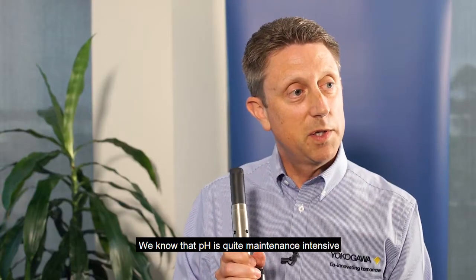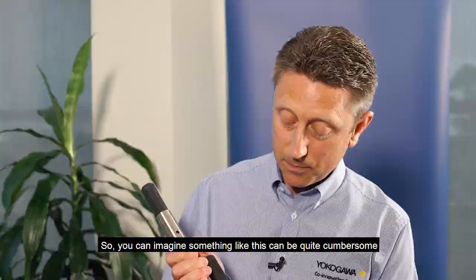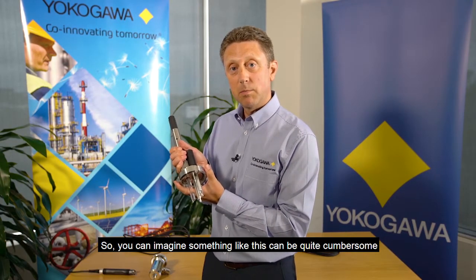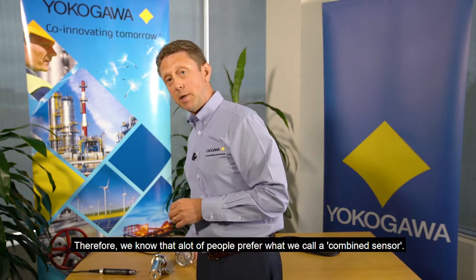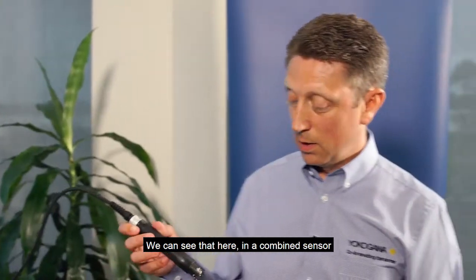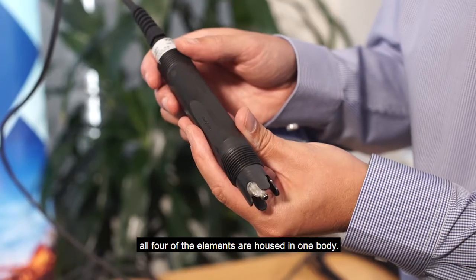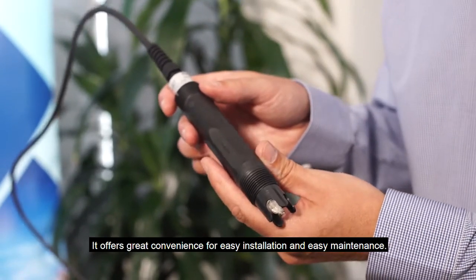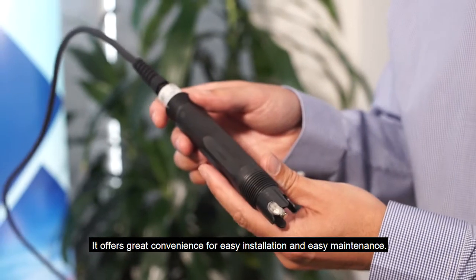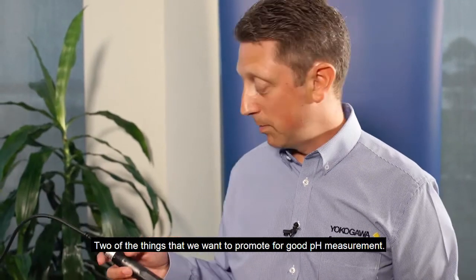We know that pH is quite maintenance intensive and requires frequent looking after. So you can imagine something like this can be quite cumbersome to look after in the plant. Therefore, we know that a lot of people prefer what we call a combined sensor. In a combined sensor, all four of the elements are housed in one body. It offers great convenience for easy installation and easy maintenance — two of the things that we want to promote for good pH measurement.